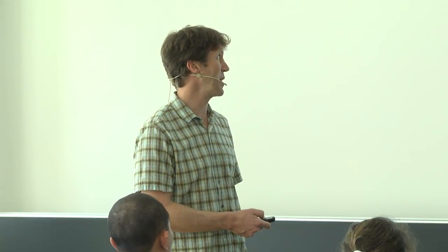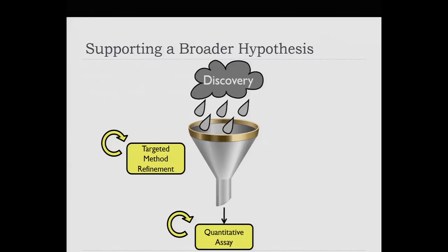With targeted proteomics, we're frequently starting with what we've learned from a discovery experiment, a shotgun experiment, putting it into this funnel here, which is beginning the cycle toward a really robust, highly repeatable quantitative assay.